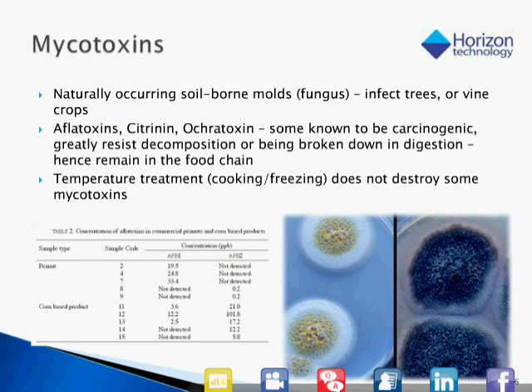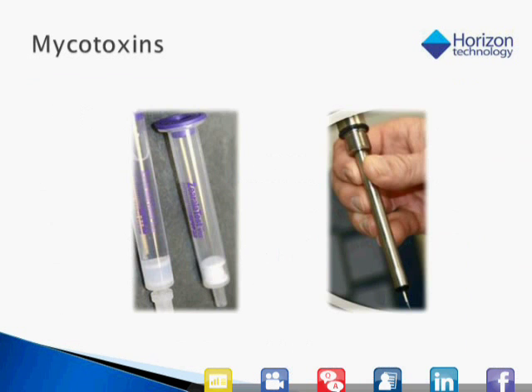This is a slide I mentioned before. The slide on the left is a typical immunoaffinity cartridge column. And the difference is it has a PBS buffer that must remain in that cartridge. And when you look at the lower left, you'll see the gel held between two frits. If the gel is able to dry out, like the cartridge on the right, which has no buffer in it, you'll see that it is contracted.